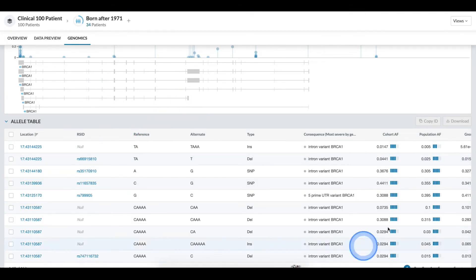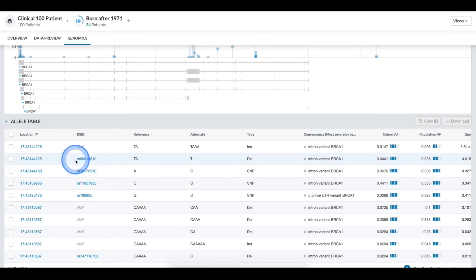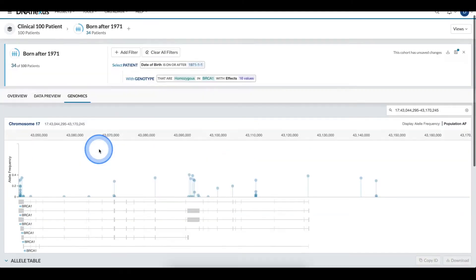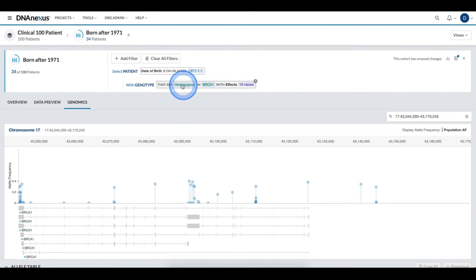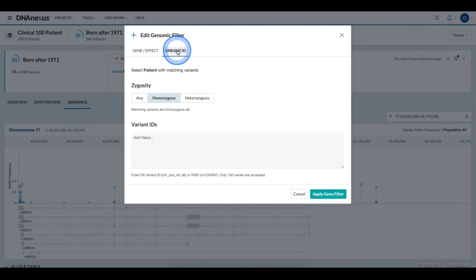Now that I've filtered down for a specific gene location, I may decide that I want to further filter down the cohort for only individuals that have this particular variant. To do this, I come back into the genomic filter and I click the variant ID tab.